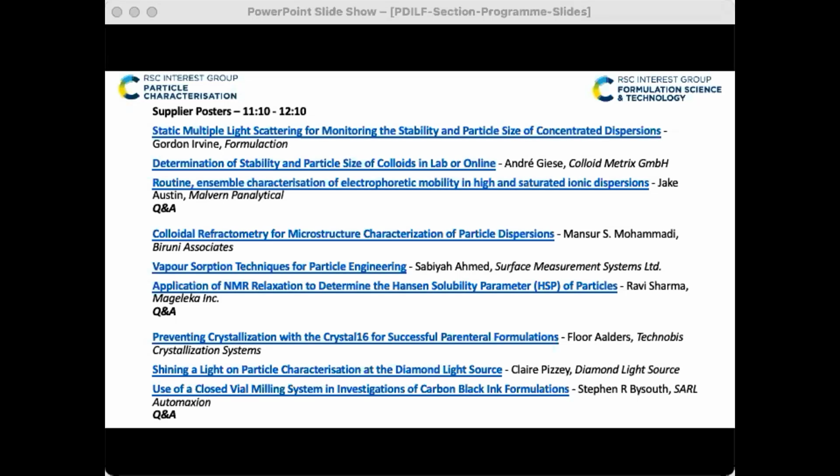What sort of sample size are these vials? I can work with vials from GC vials up to 100 milliliter vessels, and for milling, you only want to half fill them. What's the smallest size you can do? For this application, I would suggest a 10 mil sample in a 20 mil vial. Though the mills are also used for co-crystal screening, and we go down to GC vials for that, with even just 5 milligrams of sample.